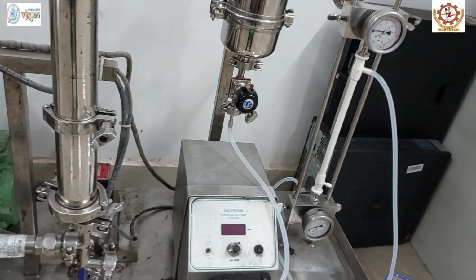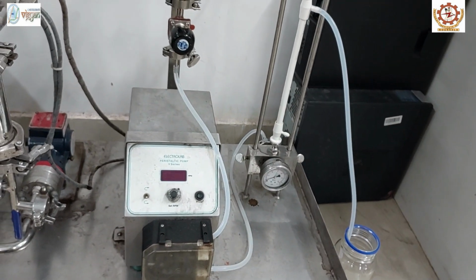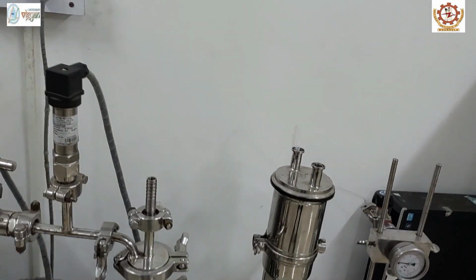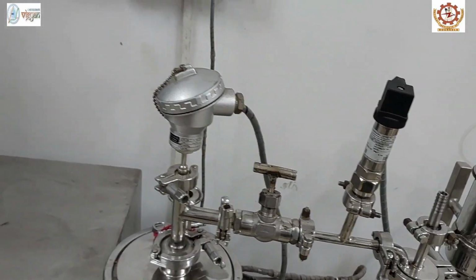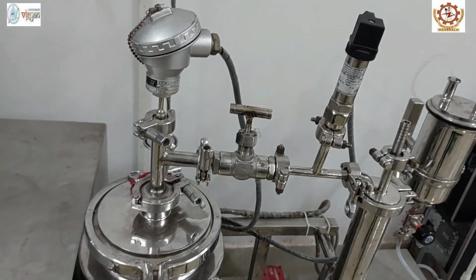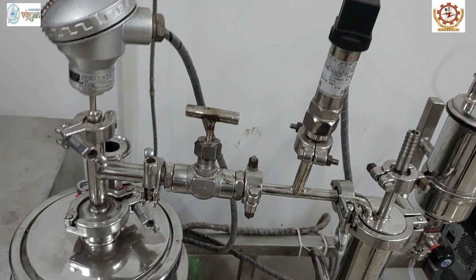Membrane processing is a non-thermal technique without any involvement of chemical agents or alteration of pH, temperature and phase. Moreover, this technology can work as a continuous process and is more energy efficient and economical.